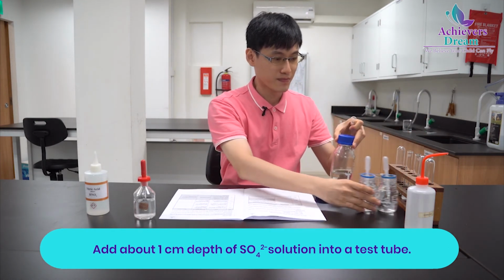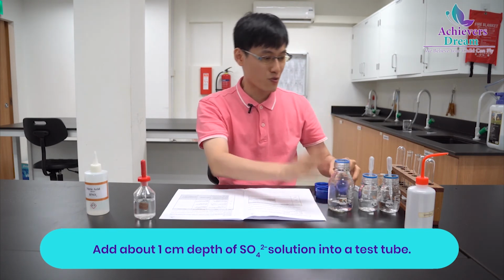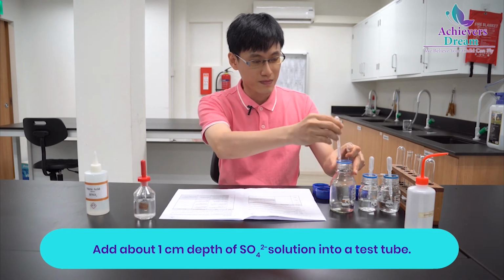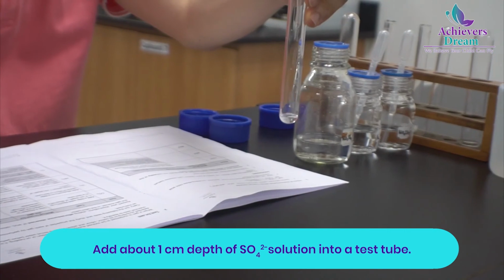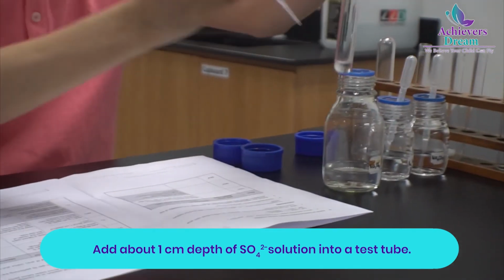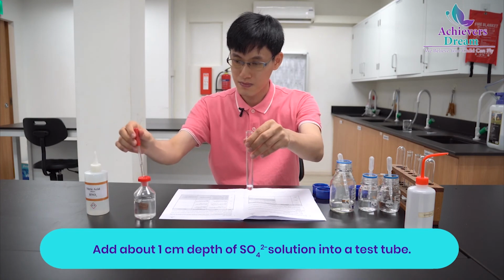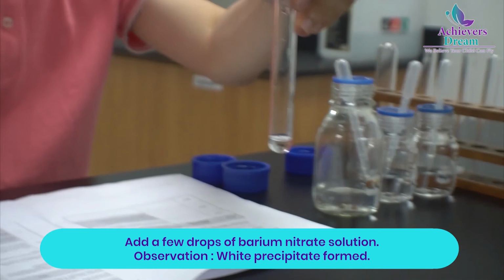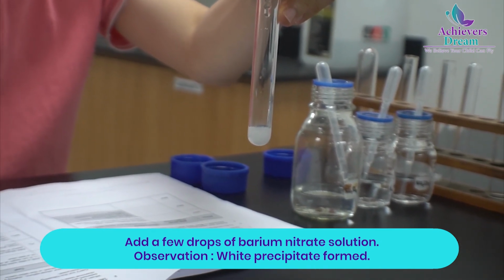Finally, let's try for sulfate. 1 cm depth of sulfate, some barium nitrate, a white precipitate of barium sulfate is formed.